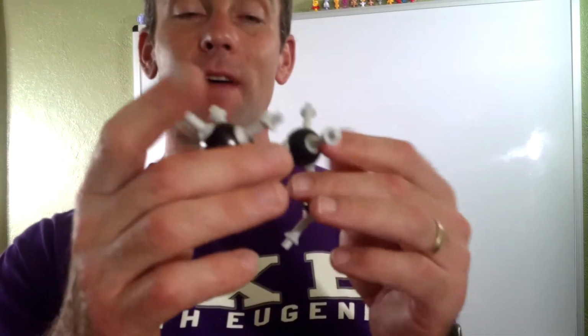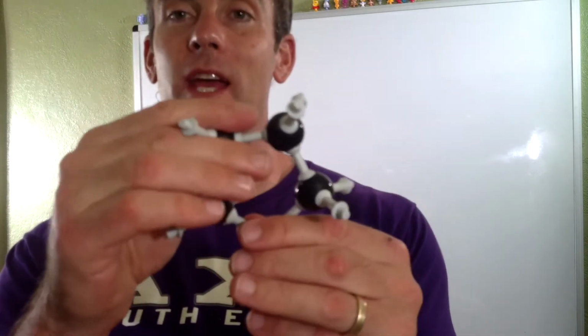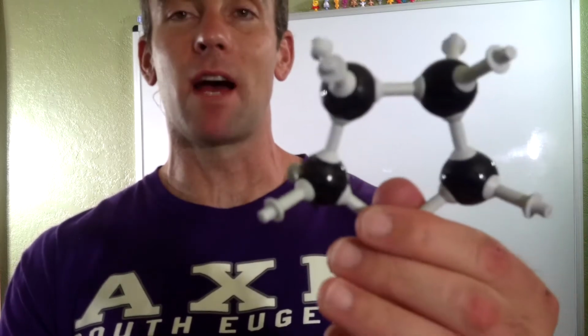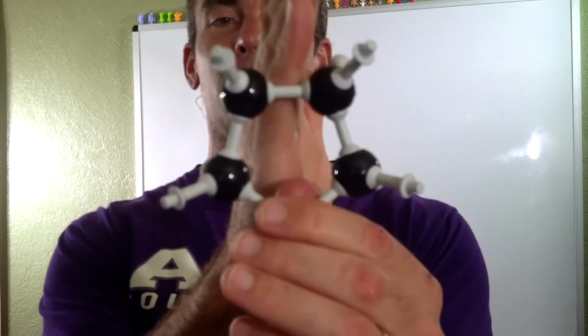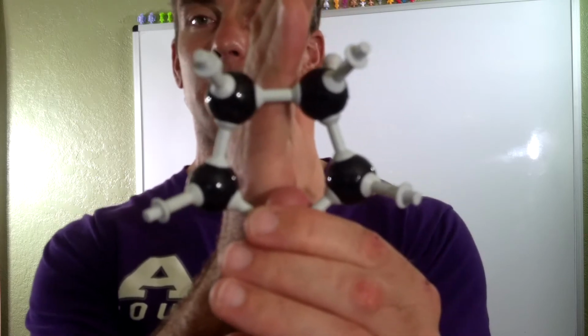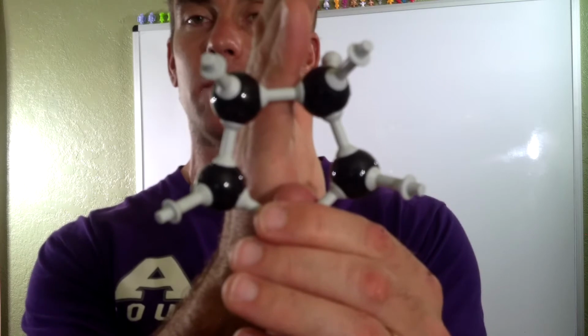Obviously, all of these bonds are rotating. And just the fact that you can get to the point where you have a symmetry plane in a really particular conformation, there's the symmetry plane, or one of them anyway, you can see that we've got a symmetry plane that bisects the middle right here. And so now we have something that's going to show two peaks on the carbon NMR spectra, having to do with the two types of carbon environments that we have.